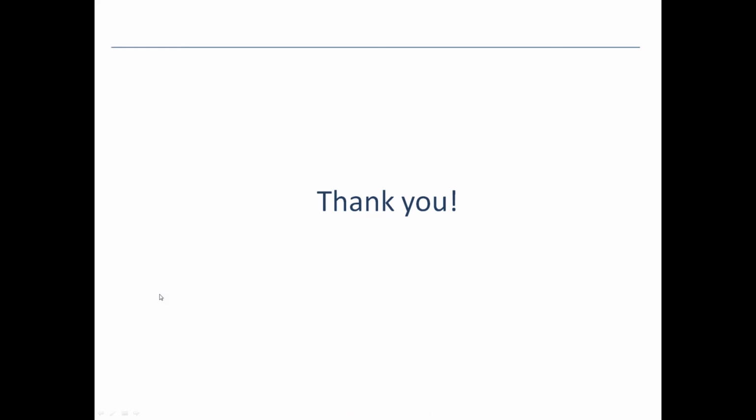Okay, so the next question is following. Could you please summarize quickly the necessary steps to avoid parachuting effect? Thanks for this question again. So there are several essential steps to avoid the parachuting effects.